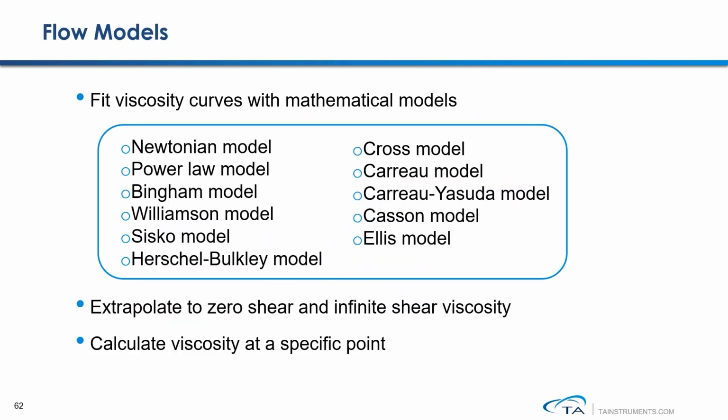After you finish a flow experiment, you can consider fitting your flow viscosity curve to one of these flow mathematical models. Here is a list of all commonly used flow models that people use to fit their viscosity curves. All of these models are available in our TRIOS software.